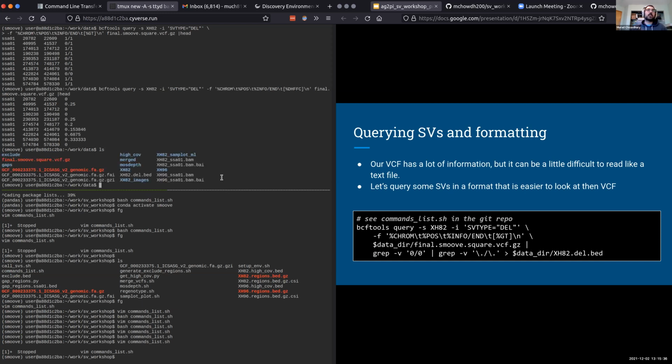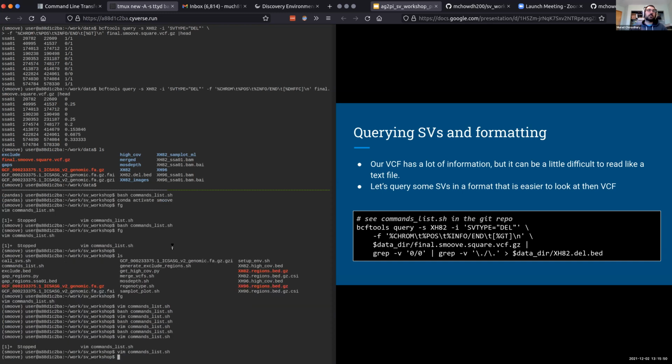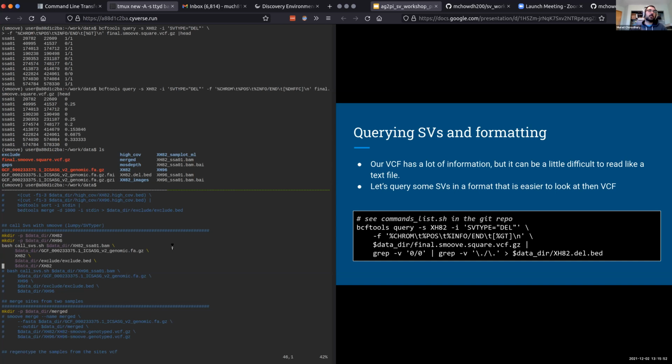So in that particular case, do I have that here? I don't, but I can basically just run that command, which I do have present in the commands list. Oh, I already had it. All right. So before I do that, I'm just going to go ahead and comment out my existing stuff here.